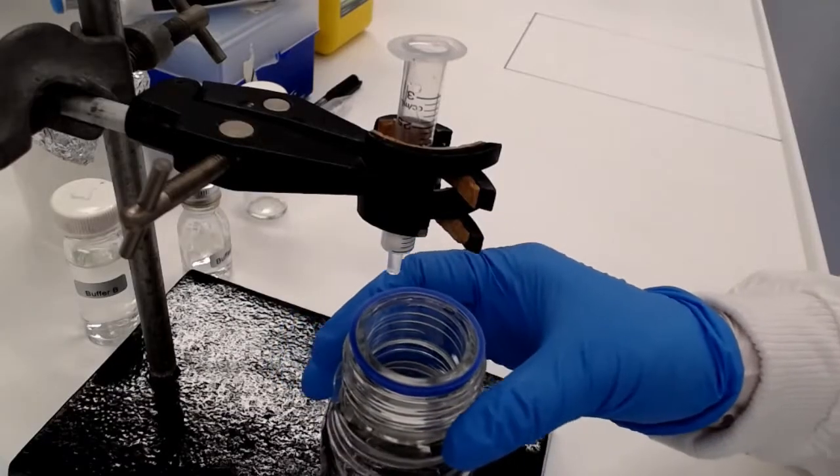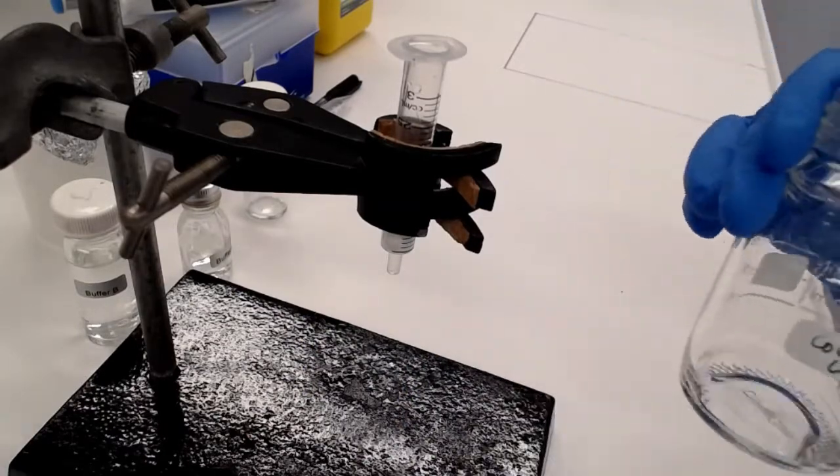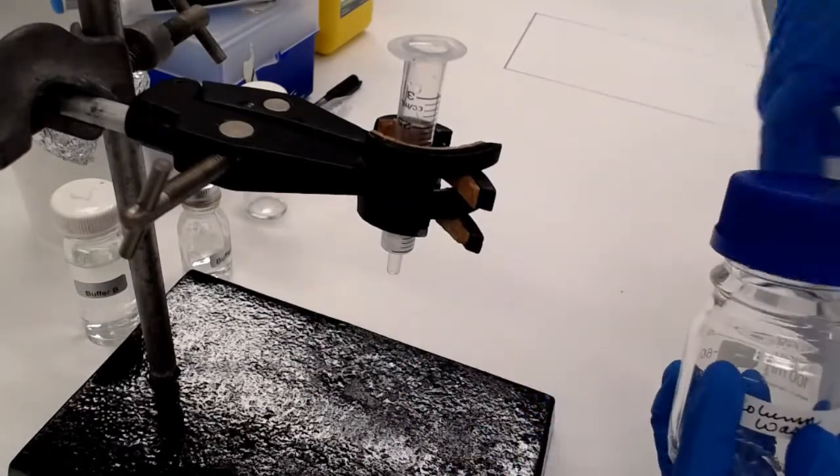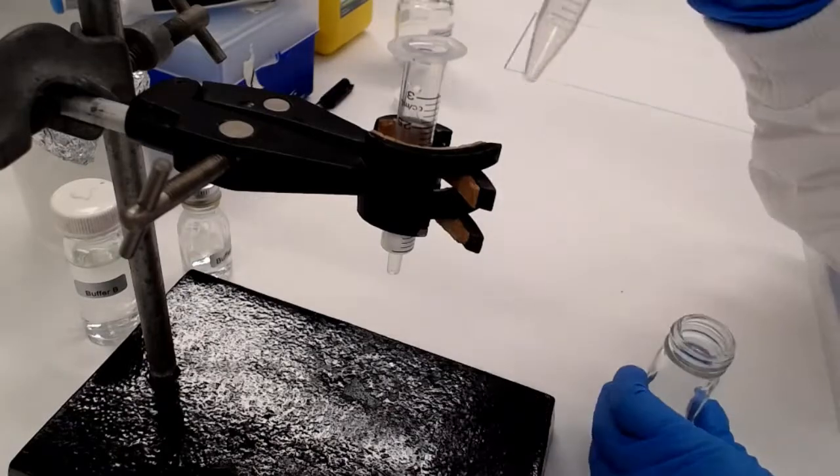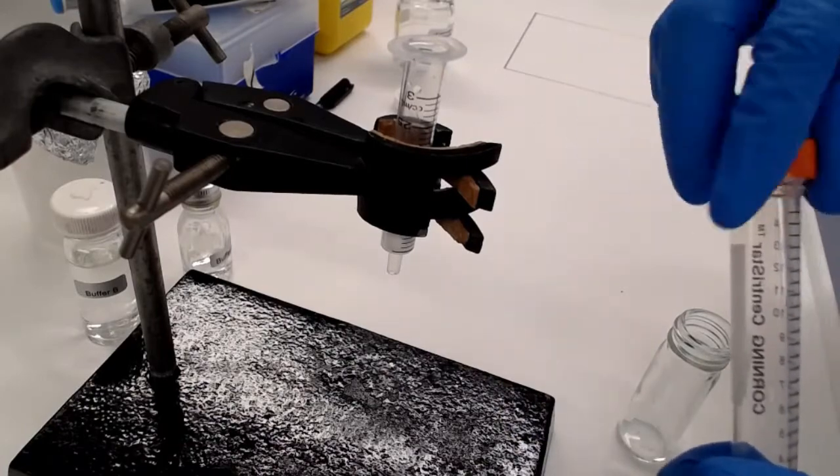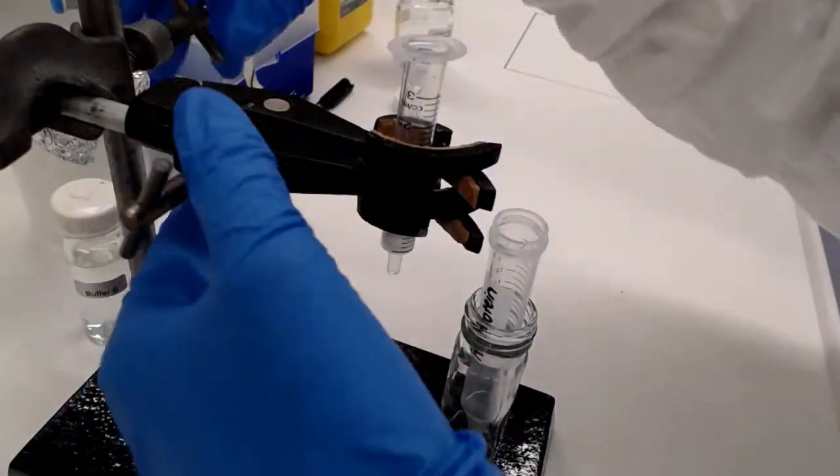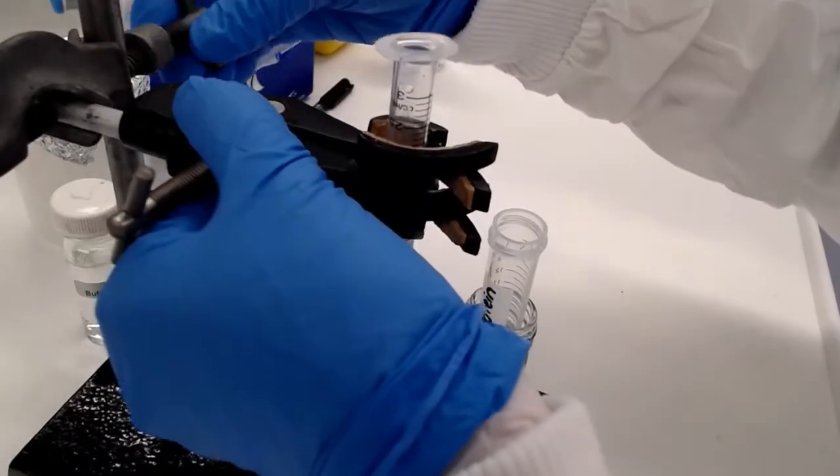We're now going to remove the column waste because the next drips that come through we want to collect and they're going to have our PFU in them. We're going to catch the PFU protein in a 15 mil falcon tube and we're just going to sit that in a McCartney bottle so it sits up straight.